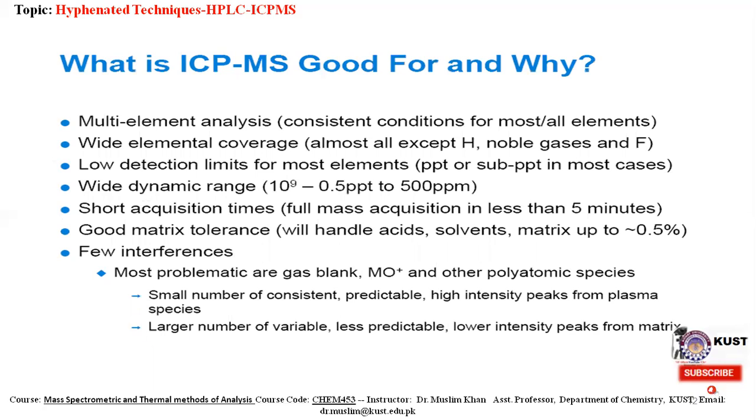First of all, what is the ICPMS system? What is ICPMS good for and why? This is multi-element analysis, suitable for most or all of the elements in the periodic table.